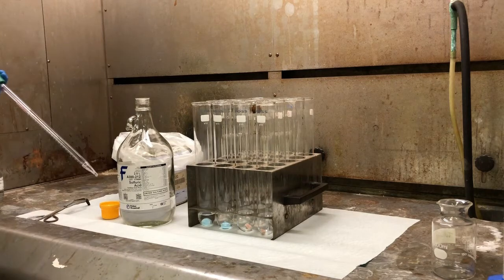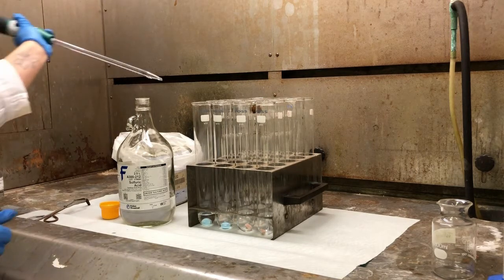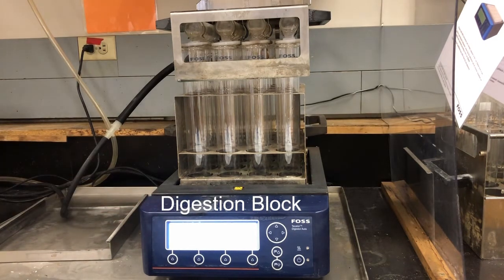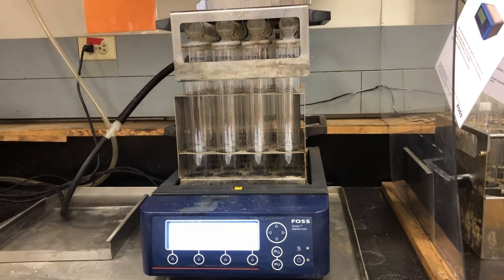And then we are ready to add them to the digestion block. Okay, so now we're over here at our digestion block. This is the digester, and you can see that our tubes with our samples in it have been placed into the heating block. In here, underneath the samples, that's our heating mantle, and that will heat up to about 421 degrees Celsius, so very high temperature.